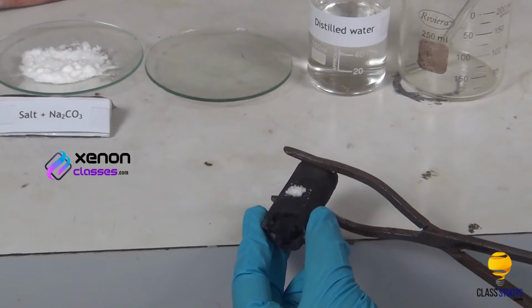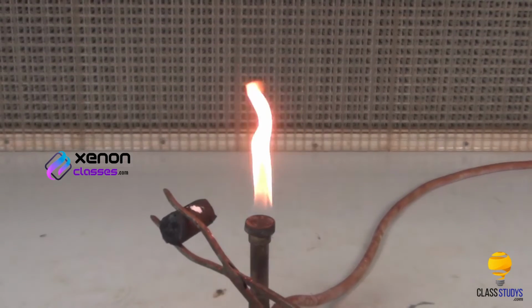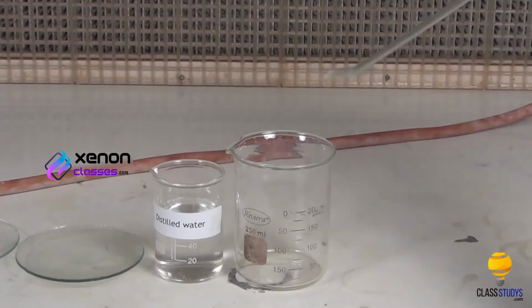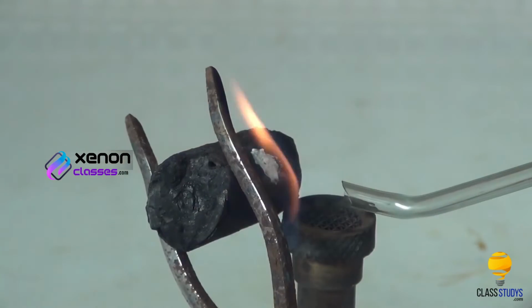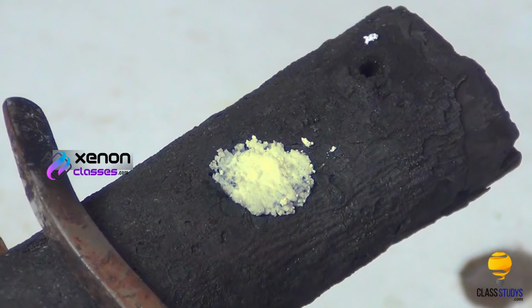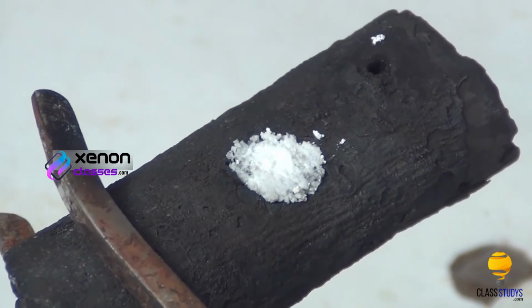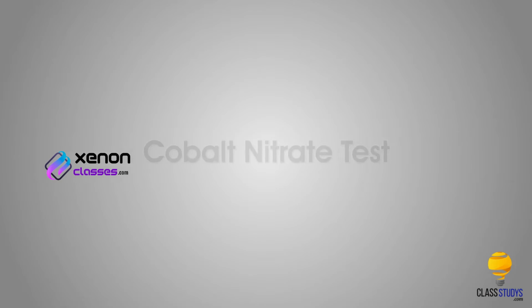Using the tongs, hold the charcoal piece in front of the reducing flame of the Bunsen burner. Now, direct the reducing flame on the cavity by means of the blowpipe and heat strongly for some time. A yellow residue is obtained on heating and it becomes white on cooling, indicating the presence of zinc ion.